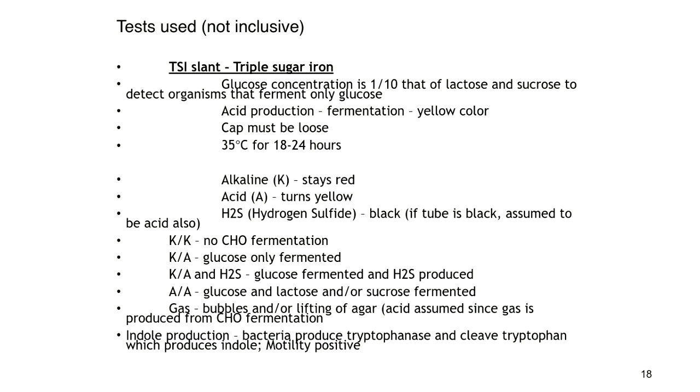This slide has a lot of information on it. Again, the biggest thing to understand is your TSI. This is an I, not a small L. That is a TSI slant, standing for triple sugar iron. That is a slant tube, and you can look at your textbook for a photo identification of that. It's what we call a slant tube, and it's used quite often for enterics.